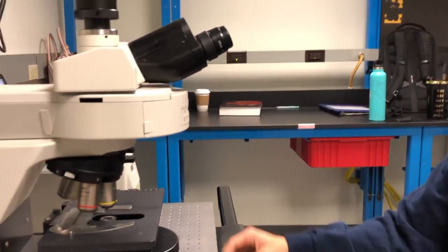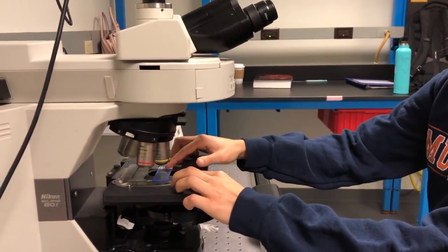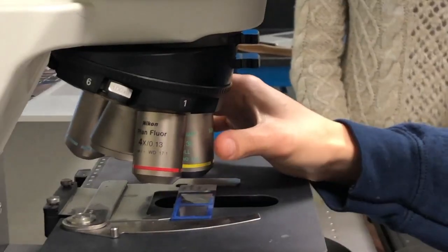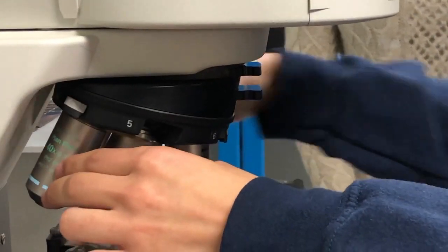So before imaging, it's important to Köhler your microscope so you can get even illumination. Start by placing your slide under the microscope, then focus the image at 10x magnification, even if you plan to use greater magnifications later on.